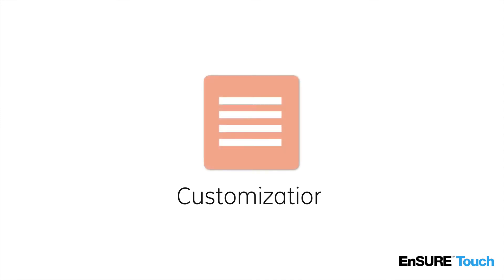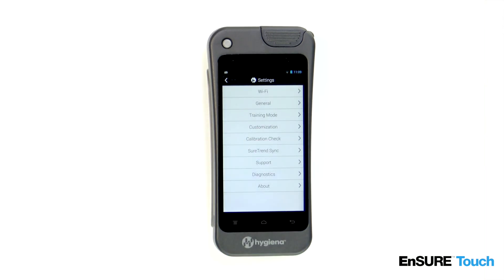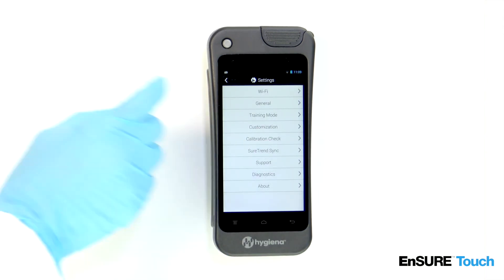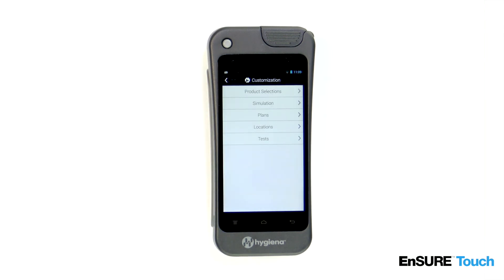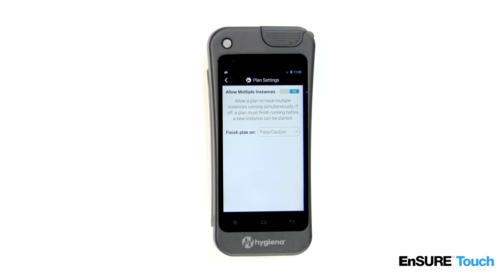Because Ensure Touch is designed with you in mind, you can make customizations to plans. To do this, open Settings, touch Customization, then touch Plans. You can choose to allow multiple instances of one plan to run at the same time. This is useful in some facilities, such as hospitals, where it could be possible to have multiple concurrent patient room plans running at the same time.